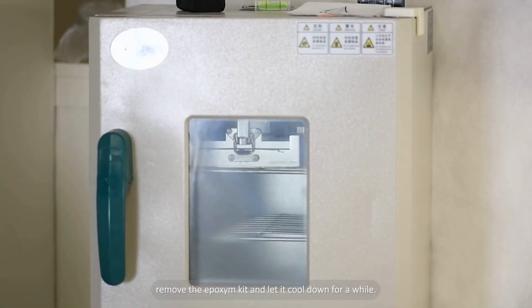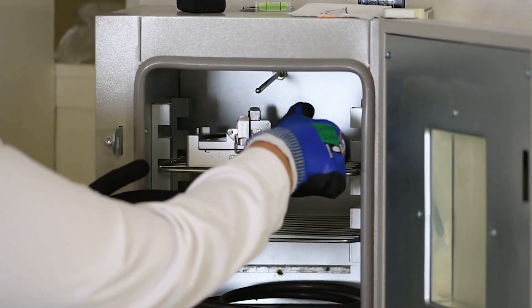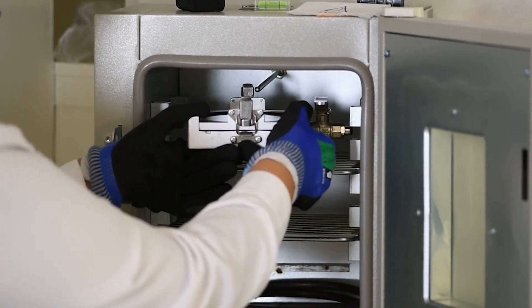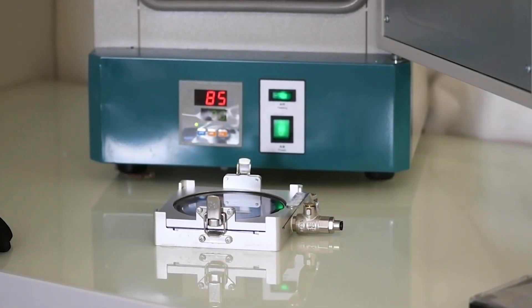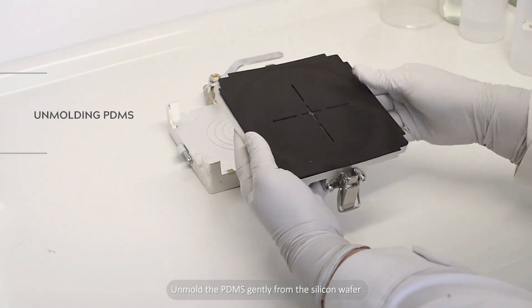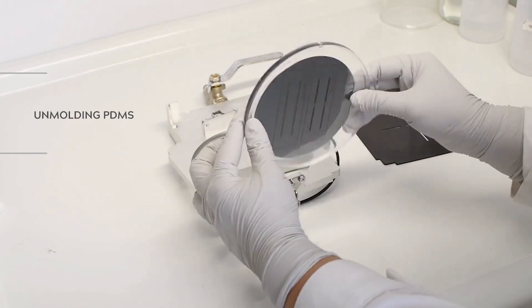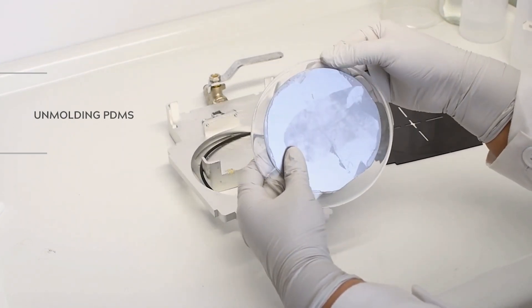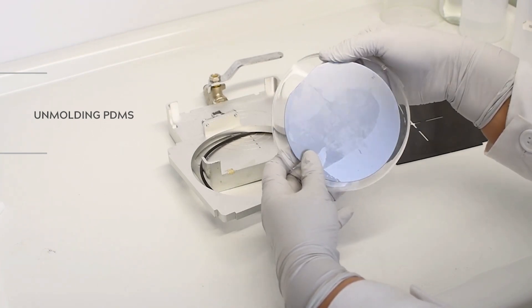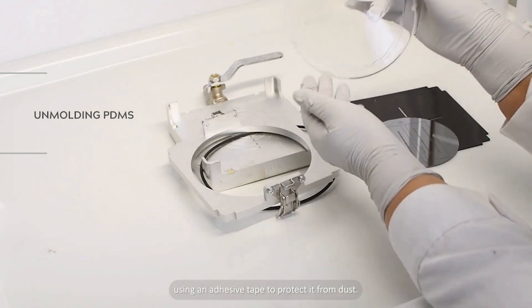After an hour, remove the Epoxym kit and let it cool down for a while. Then unmold the PDMS gently from the silicon wafer. In case of difficulty, IPA can be used. Cover the PDMS mold using an adhesive tape to protect it from dust.